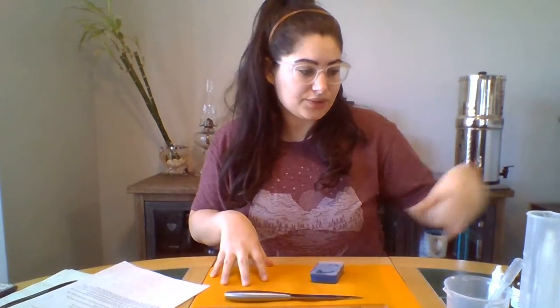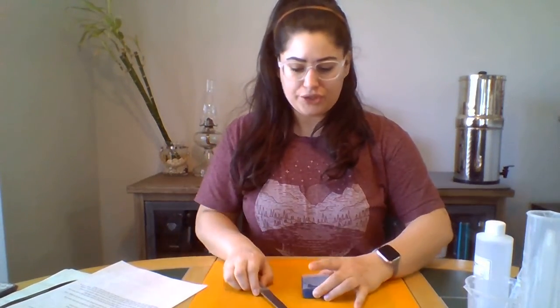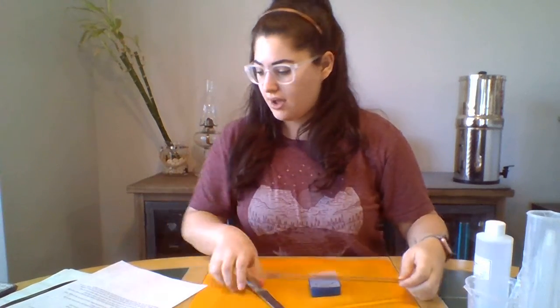And then I have all of my supplies here as well. The acetic acid, the vinegar, and then all of these mixings, if you can see that. And then I couldn't find the pad that was supposed to go under. I didn't have a safety bag really in my kit, but I have this cutting board just from my kitchen that I had planned on using, and it's okay. I don't know if the blue will tint it, but that's fine if it does. Ruler to measure it out, knife to cut it with.